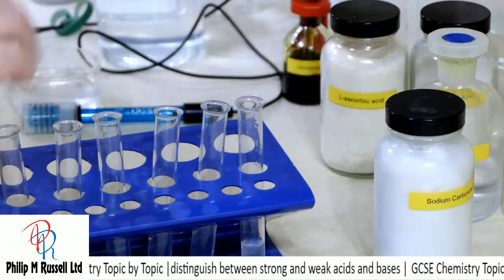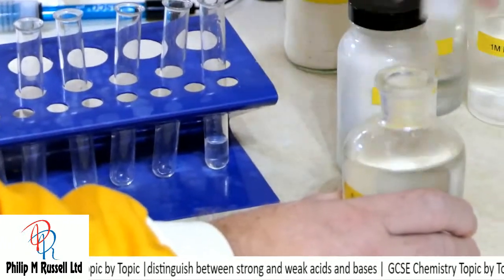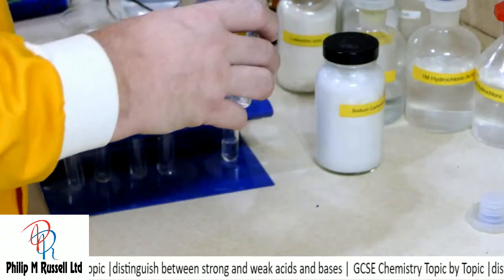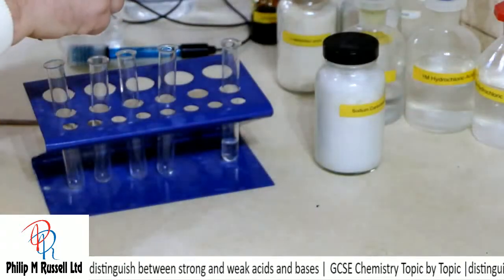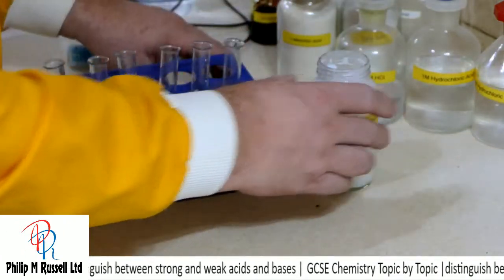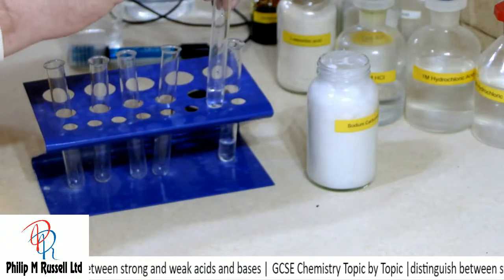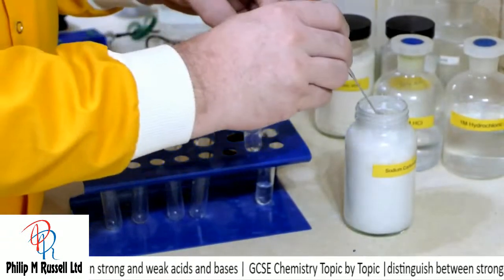Let's compare that with a different acid. Let's take some sulfuric acid. Again, I've put about a finger's depth in, and let's try a bit of sodium carbonate with this. Let's compare. Well, there's not much in it, was there?